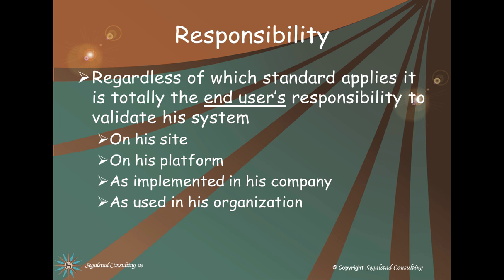Regardless of which standard applies, it's totally the end user's responsibility to validate his system. That is on his site, on his platform, as implemented in his company, and as used in his organization.